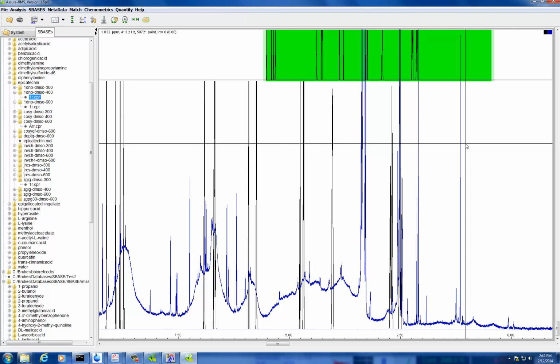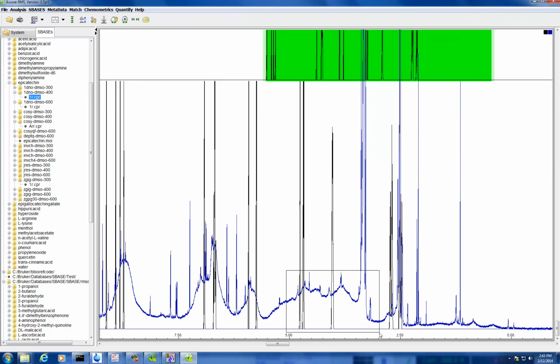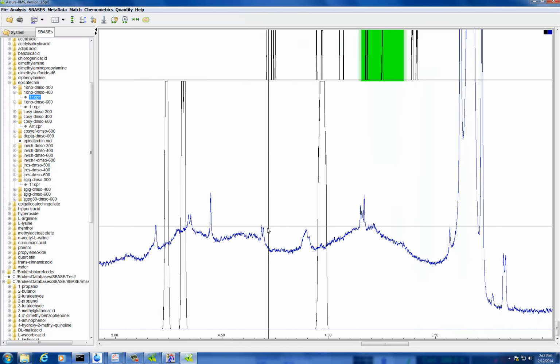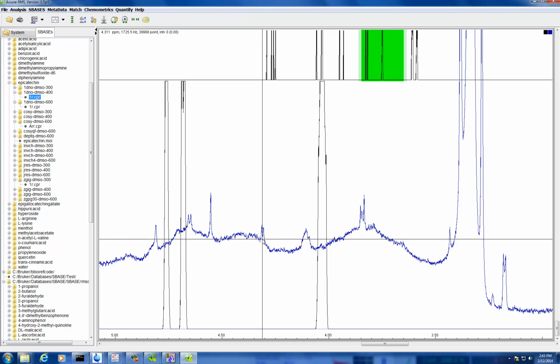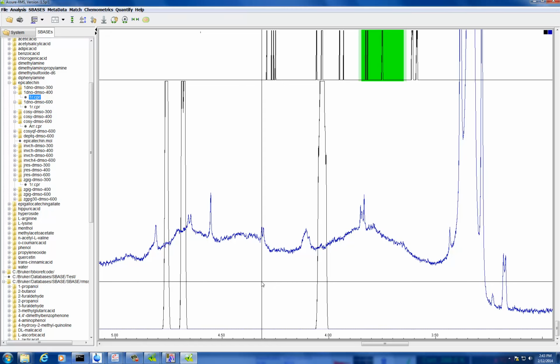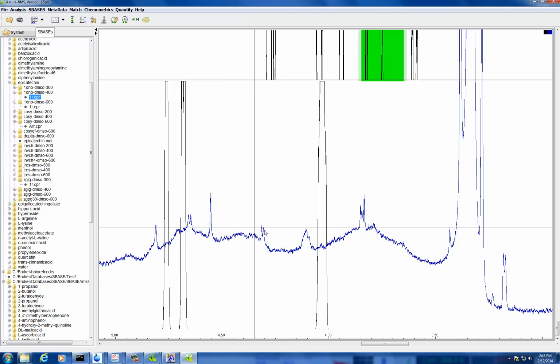Well, if you were trying to pick out epicatechin or even procyanidin B2 out of that mixture, that might help, because it would get rid of the larger PACs and you would just see the small ones. I would consider this more of a worst case scenario, but what's nice about it is, let's focus on something like this here. If you want to know if this is here or not, if you run the CPMG, then you will remove all this broadness, and then you can go, you know what, this is actually this peak now. But right now everything is broad, so you're not sure.